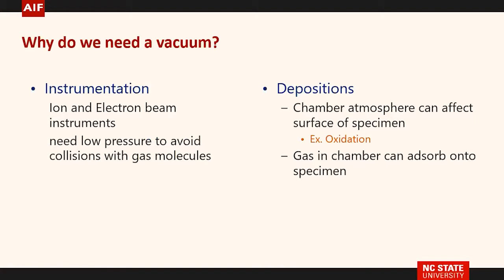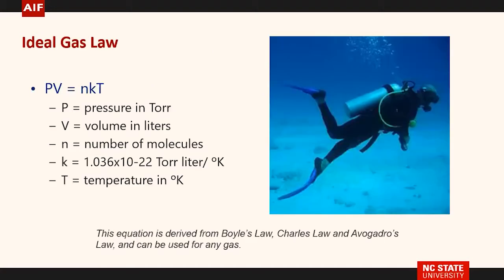Why do we need a vacuum? Well, the instrumentation we use, especially if you're in the analytical field, uses ion and electron beams, and they don't go too far in air. So we need a low pressure there. Many of you also probably work with vacuum systems for doing depositions. In that case, the gas in the chamber can oxidize or change what's in the process you want, or contaminate it. So there are lots of reasons to have a vacuum.